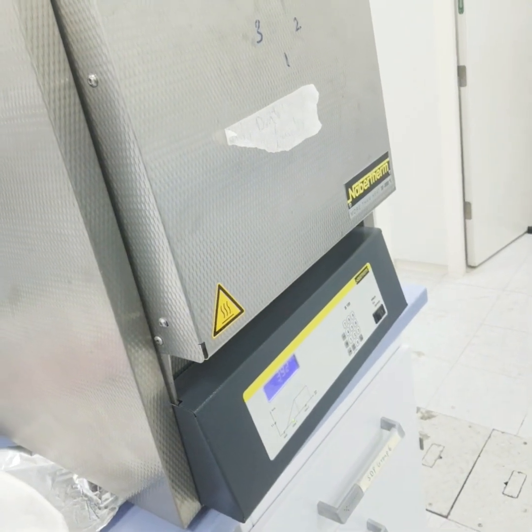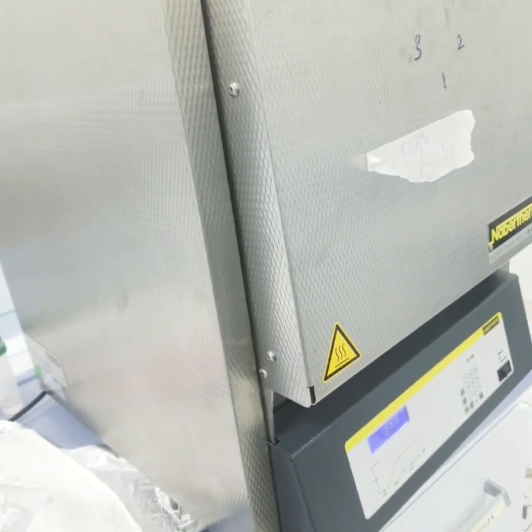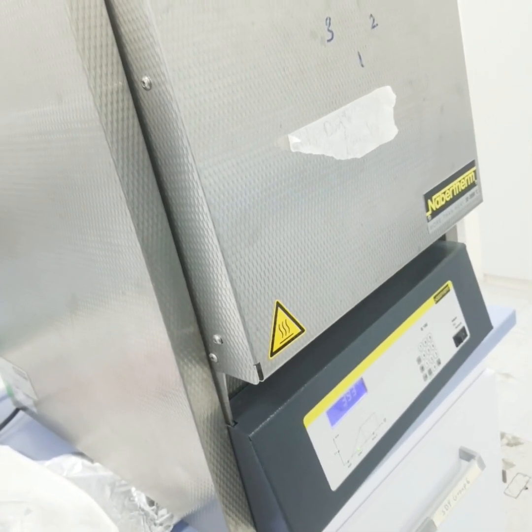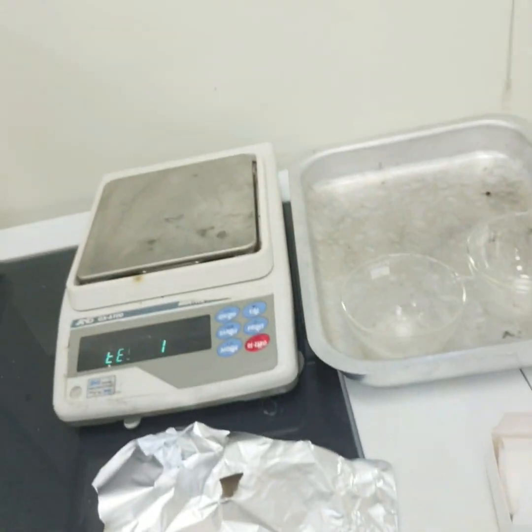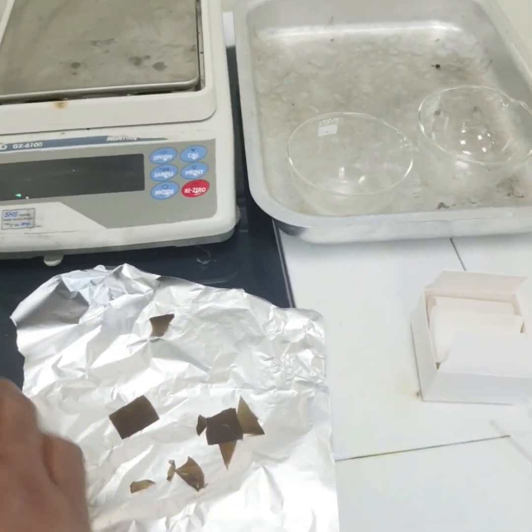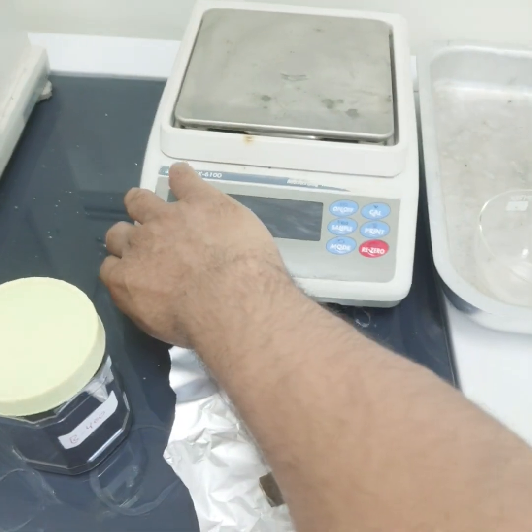This is also an alternative method to TGA, thermogravimetric analysis, which is also used to find the filler content within smaller sample sizes, because here the sample size is bigger, around 2 grams. For carrying out this analysis we need the solid sample, some crucibles, tongs, and the weighing balance, which should be very clean.